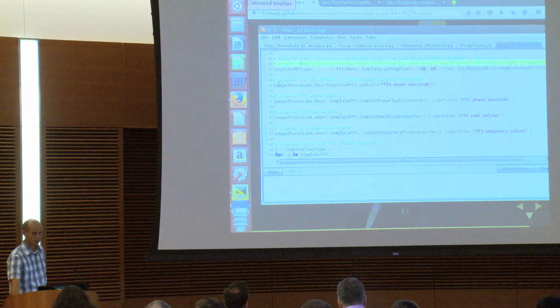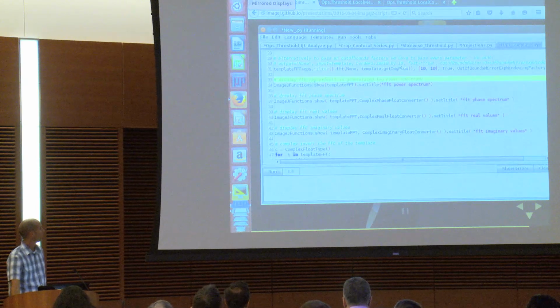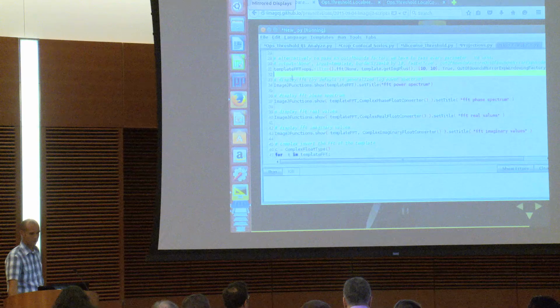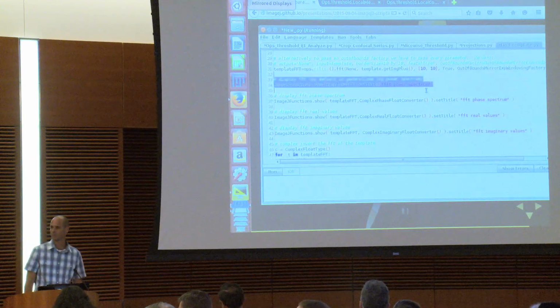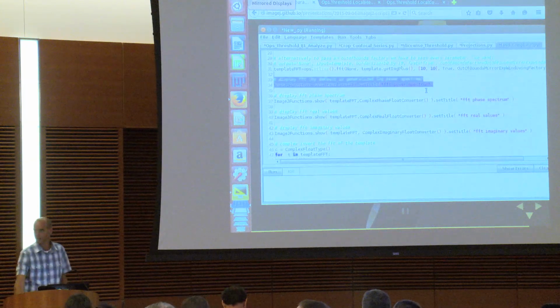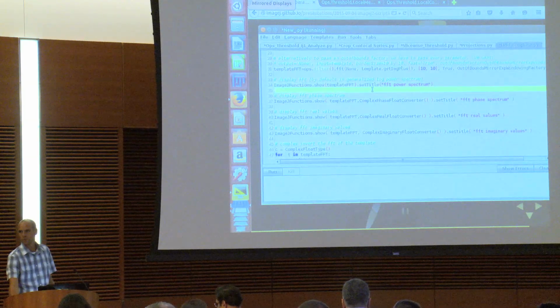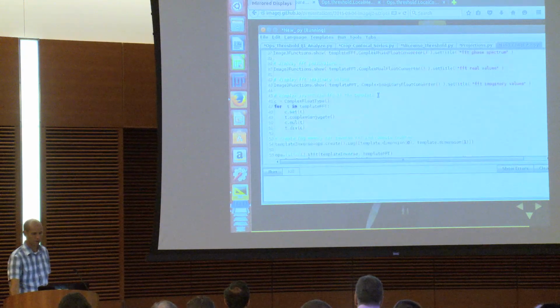Then there's a utility, I think it's an ImageLib2 utility as well, that allows us to visualize the results of the FFT. These FFTs are complex. Just to elaborate quickly, that function predates ImageJ2. It existed when ImageLib2 was just embedded inside ImageJ1, essentially. It was a little viewer. The reason we're still using it instead of the UI.show call that we're using everywhere else is because this thing is smarter about complex numbers. So this thing will show your phase. For now, you can look at your real and imaginary parts.